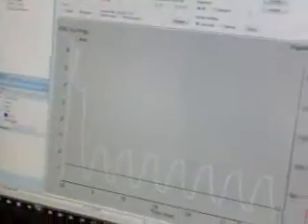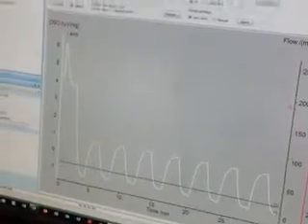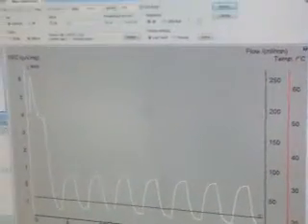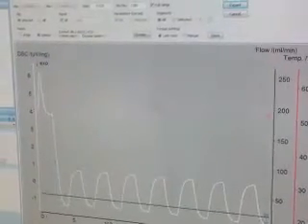Alright, and then I go comma, true, comma, true. Right? And then I push enter, and now this is the slope of this XY data. Alright, and that corresponds to this first, let's see, which one is this one? That corresponds to this little thing here, so it's probably not going to be useful. The second one comes down here.